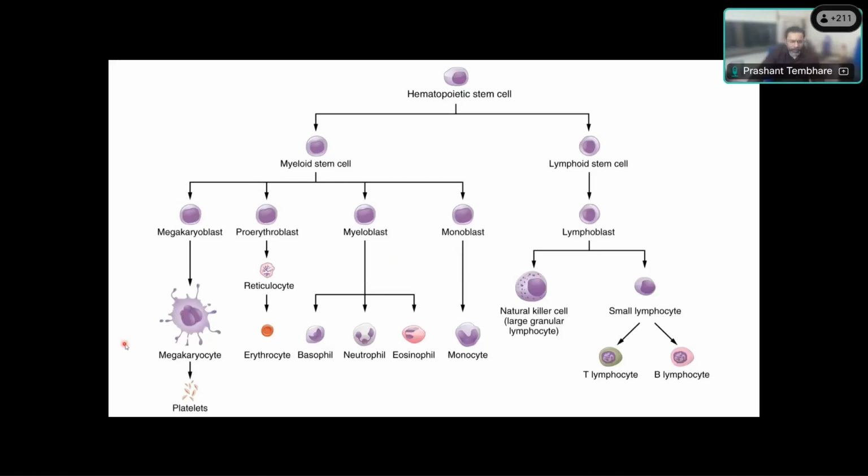The megakaryocyte series is usually difficult to study normally because there are very few precursors of the megakaryocyte lineage, and very few megakaryocytes in the sample. So it's difficult by flow cytometry, but if they increase, for example in megakaryocytic leukemia, then you can study them. And lymphoid, Dr. Gaurav is going to cover. So we are going to focus on this part.